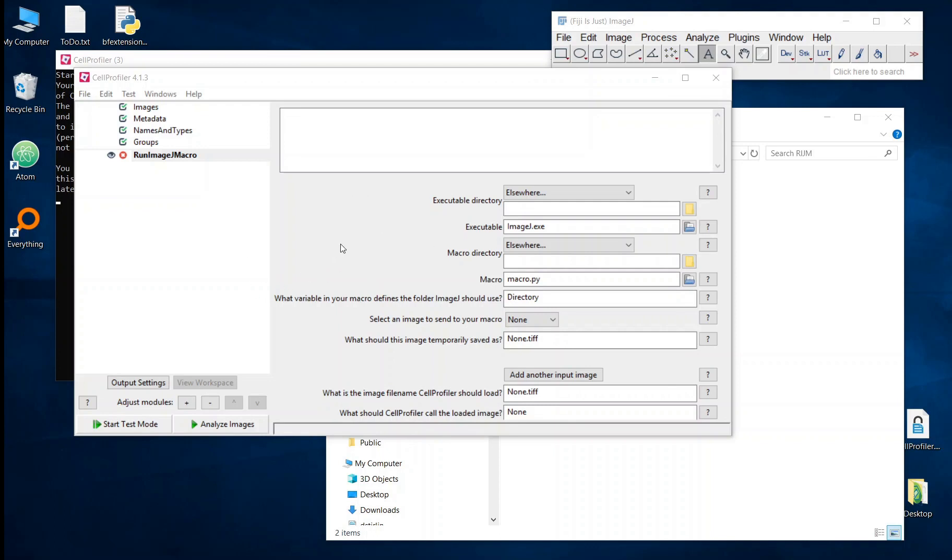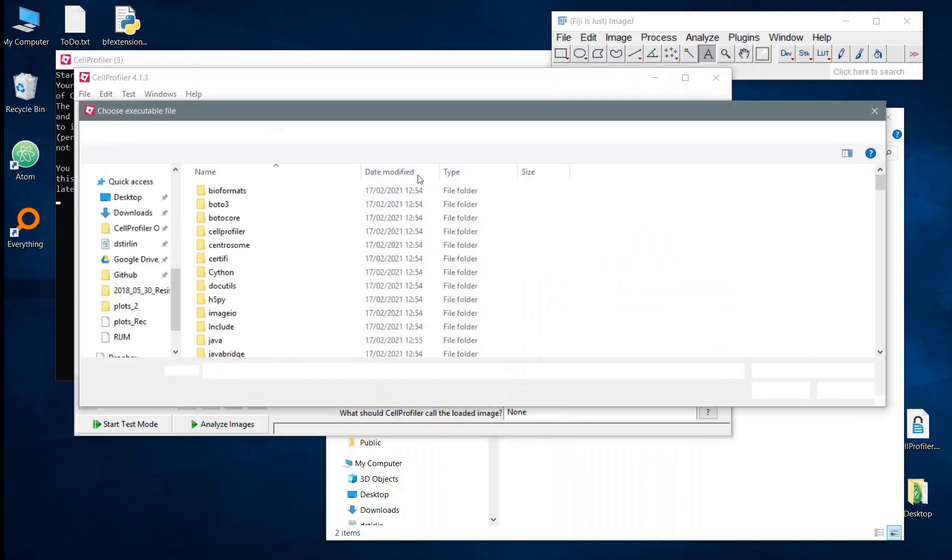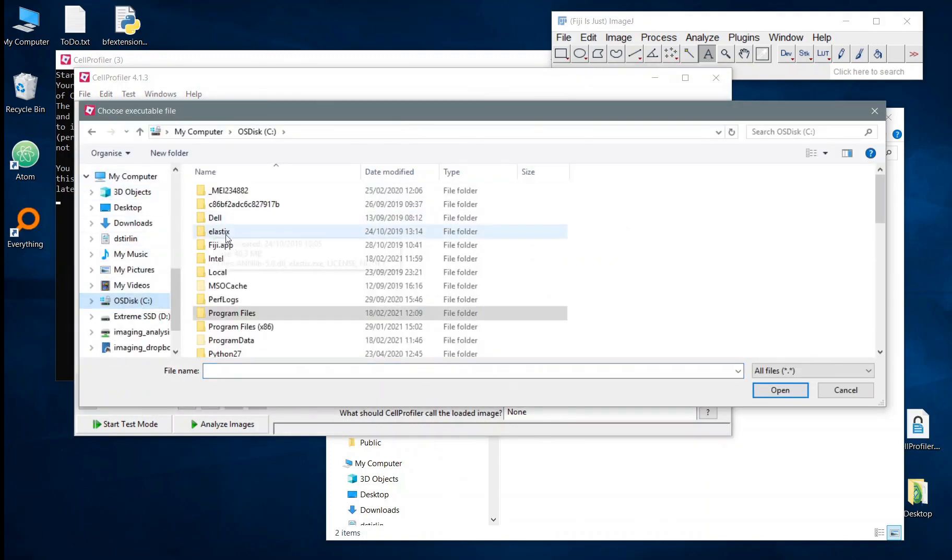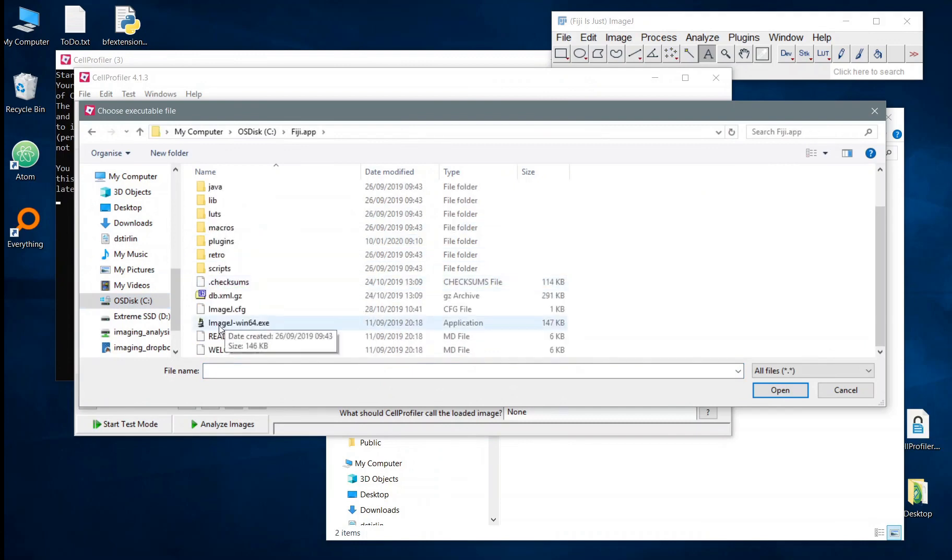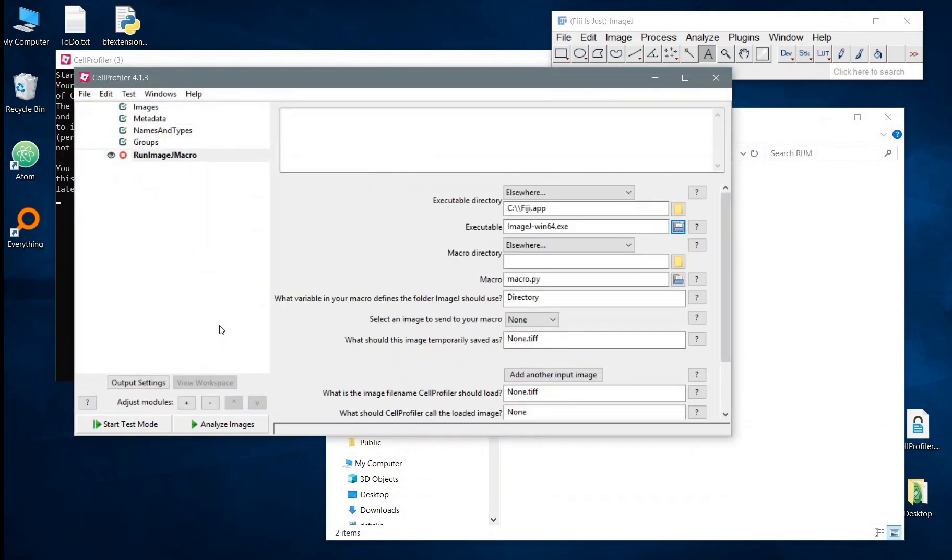So the first thing we're going to need to do here is to find our ImageJ installation. Either Fiji or ImageJ should work just fine. We click this button we can then get to the directory it's stored in. So in this case it's Fiji.exe but if you're on Mac it may be a .app file.